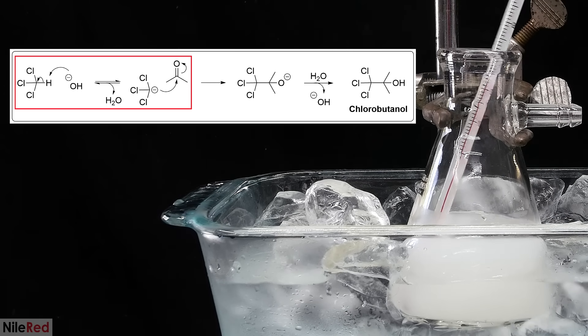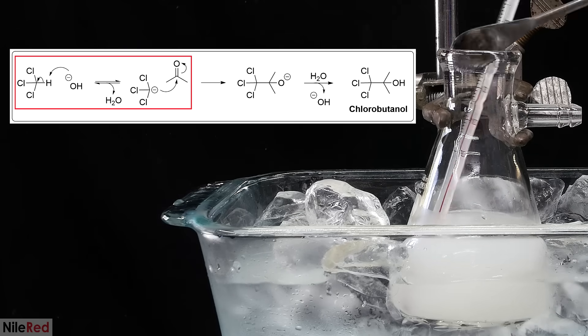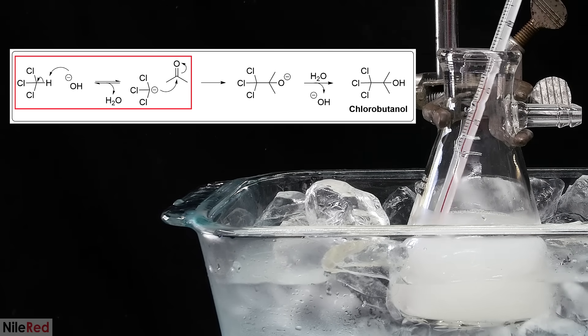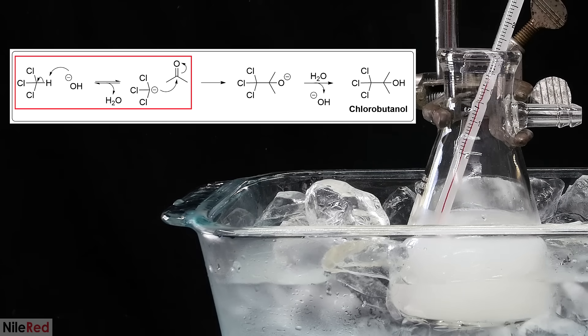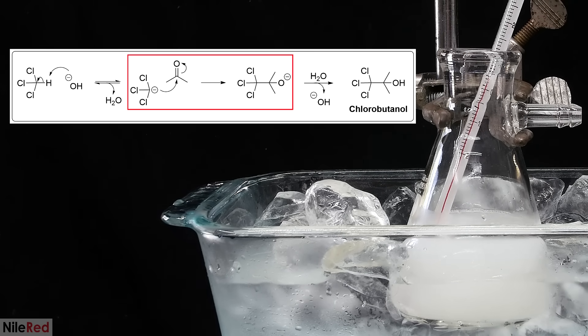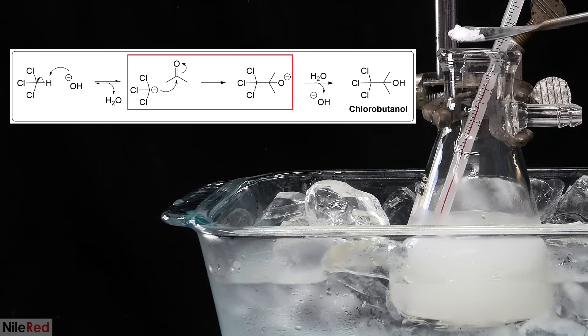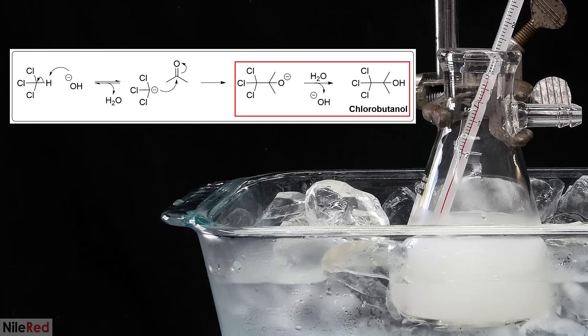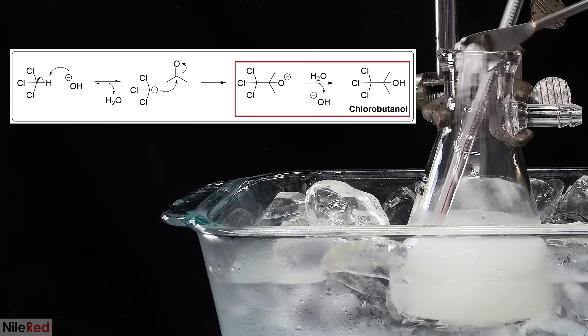In the first step, the hydroxide ion from the potassium hydroxide reacts with the slightly acidic hydrogen of chloroform. This leads to the production of a negatively charged intermediate and water as a side product. This intermediate then attacks a molecule of acetone, and the carbonyl opens up. The negative charge on the oxygen picks up a hydrogen from the water that formed earlier, which regenerates the base catalyst.